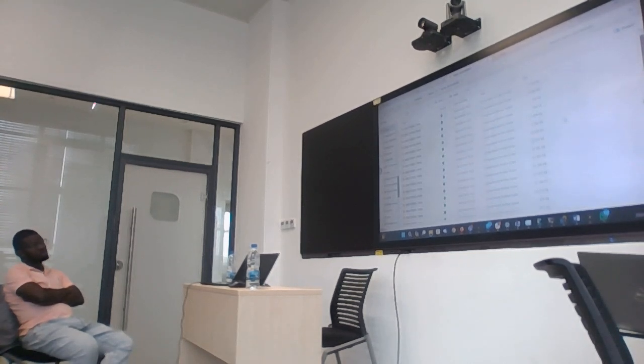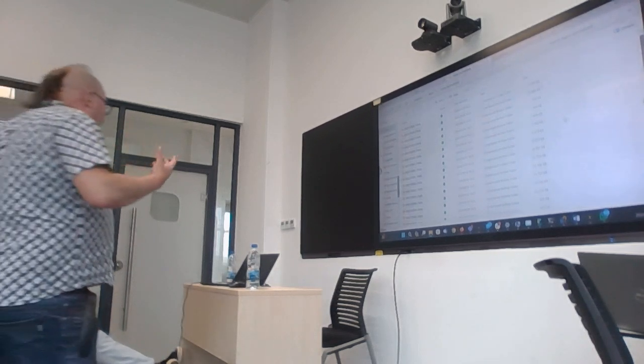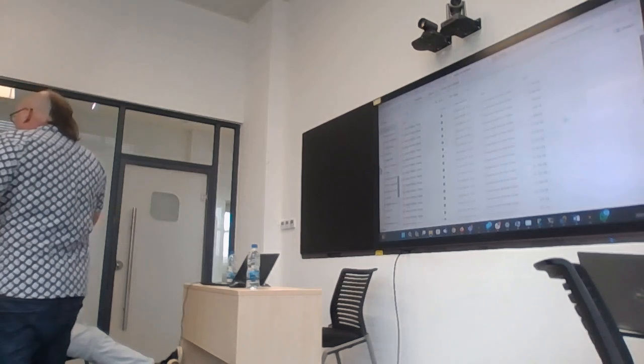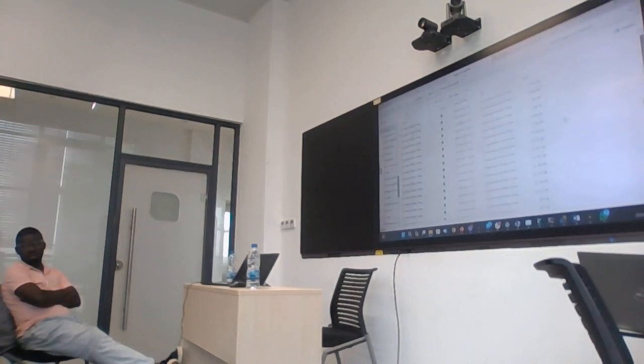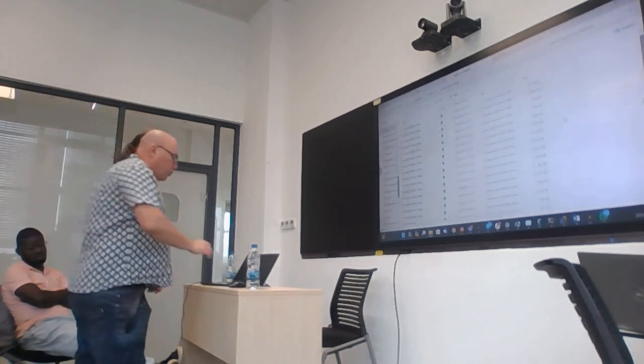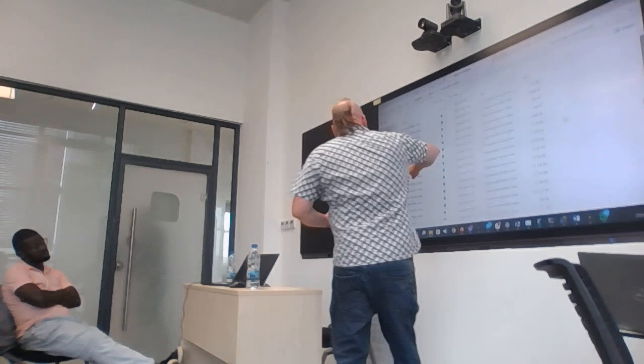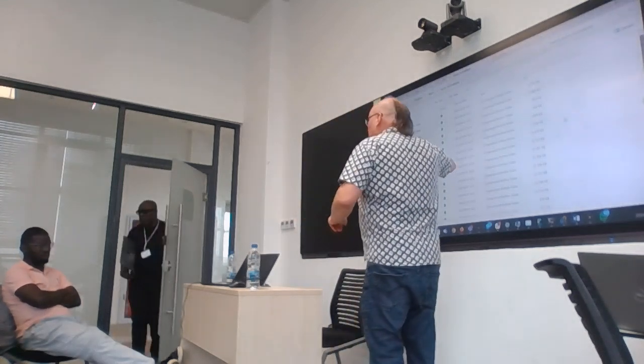Those very small ones were taken from very high CT value, 36 CT or something like that, where there's almost nothing. So we can immediately see quality control: keep an eye on the file size. If it's very small, something might be wrong. Then I want us to choose... the other thing is, of course, this is Illumina data, so everything is paired. 1, 2, 1, 2, okay?